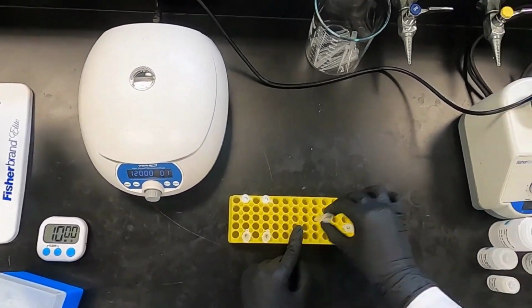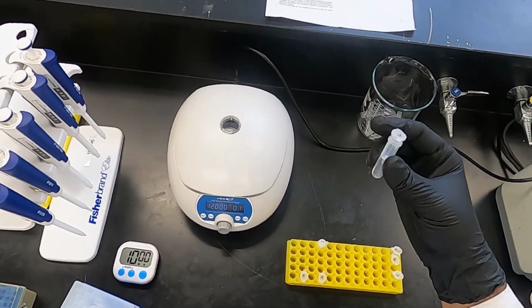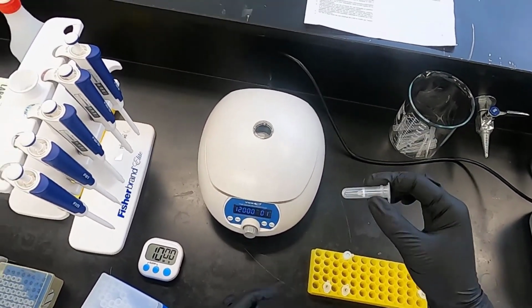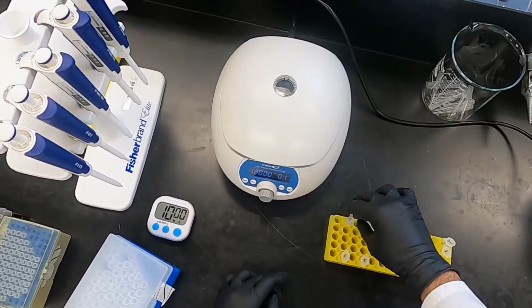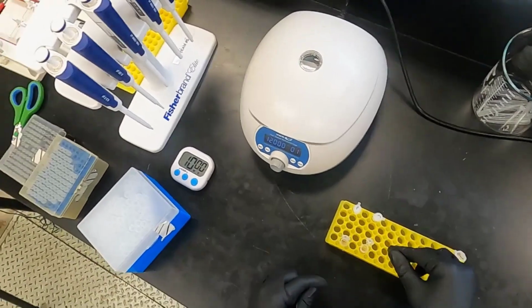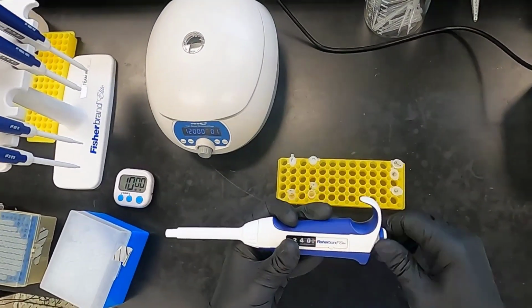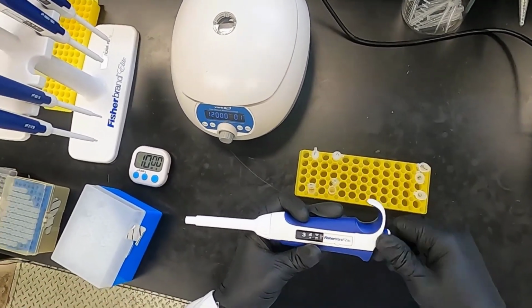Put the ethanol away. And then we're going to transfer these into these centrifuge tubes. They're 2 milliliters. And we're going to use them during centrifugation to collect any excess out that we don't need. So what we're going to do is we're going to take 800 of each, and we're going to put them into these tubes. So set your pipetter to 800.